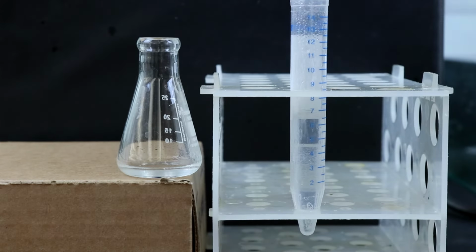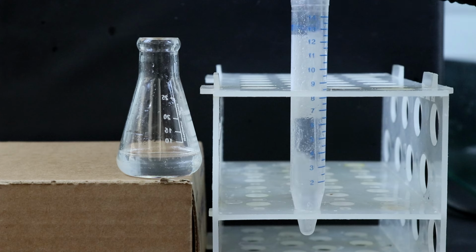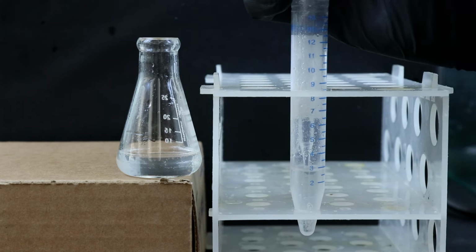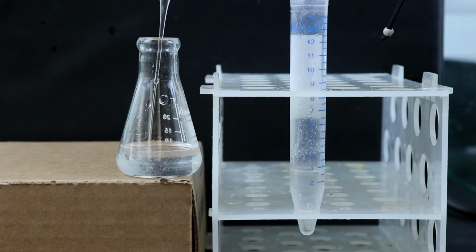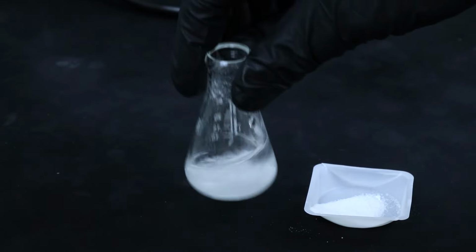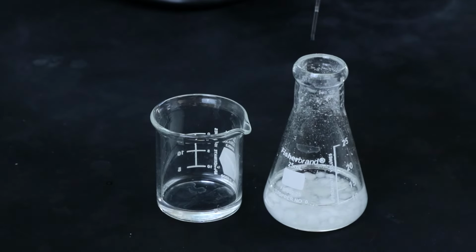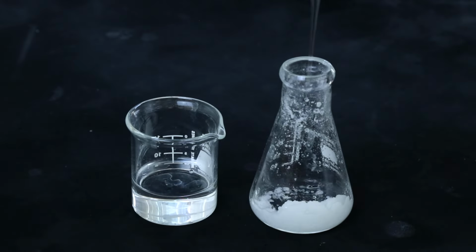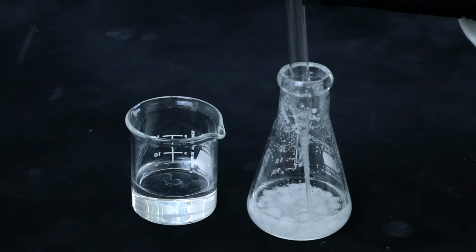So now I'll remove the organic layer from the aqueous one, and then extract that aqueous layer 3 times with some additional methylene chloride. Once those extracts are gathered, I'll dry them over sodium sulfate, and I'll add that until it's free flowing. Then I can remove the methylene chloride solution and rinse the remaining sodium sulfate with some additional methylene chloride to reclaim any unknown alcohol that would have been left behind.